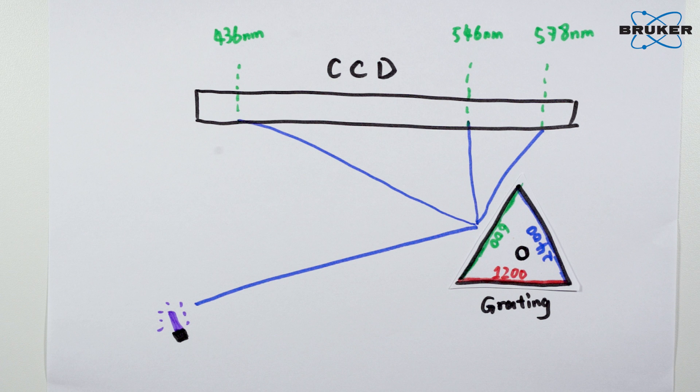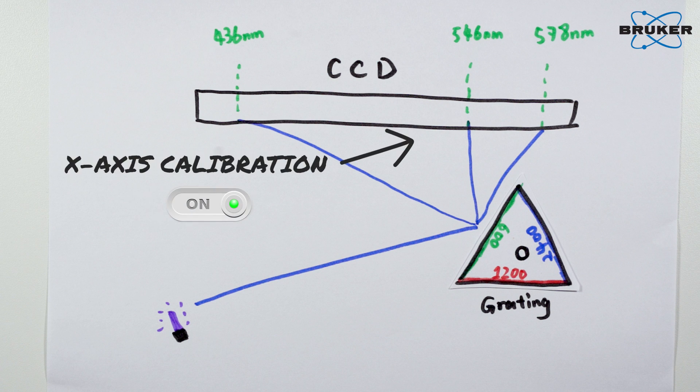From the measurement of the calibration lamp, we can easily calibrate the x-axis of the Raman spectra.